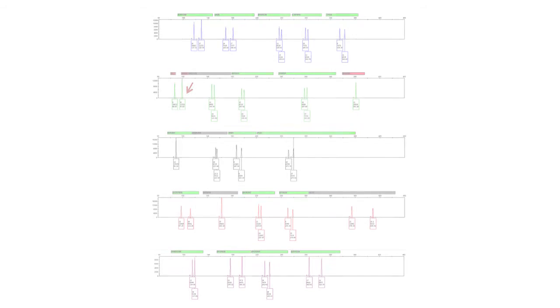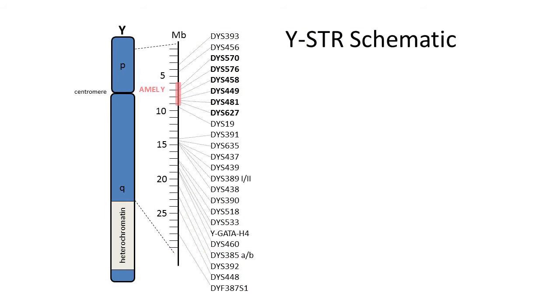Let's look at an example. Here we have a single-source male profile that is missing alleles at multiple markers. The affected markers are in close proximity on the Y chromosome, leading to the conclusion that there was a large deletion spanning a length of the chromosome and affecting all markers in that location. Using these markers to determine number of contributors could lead an analyst to underestimate the number of male contributors in a mixture.